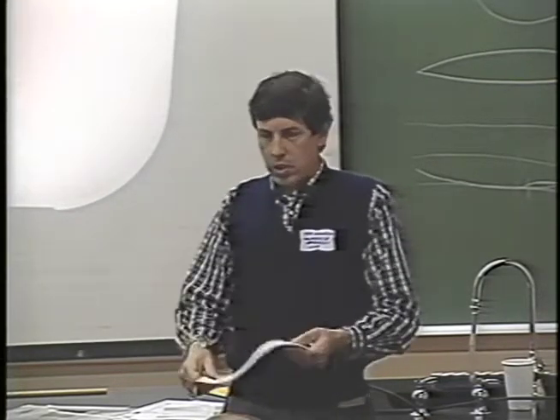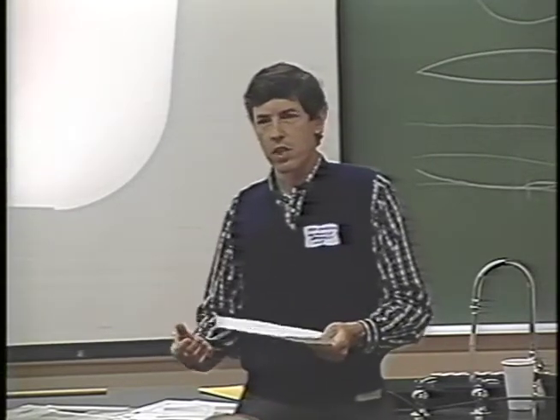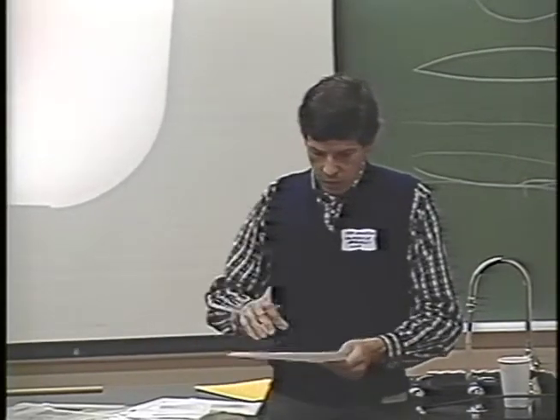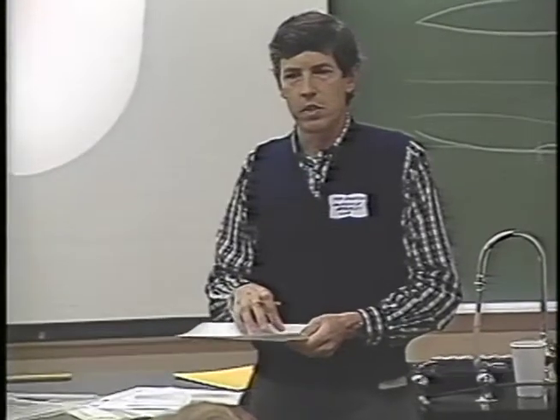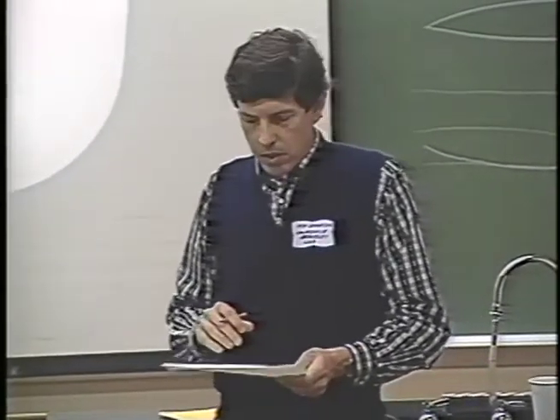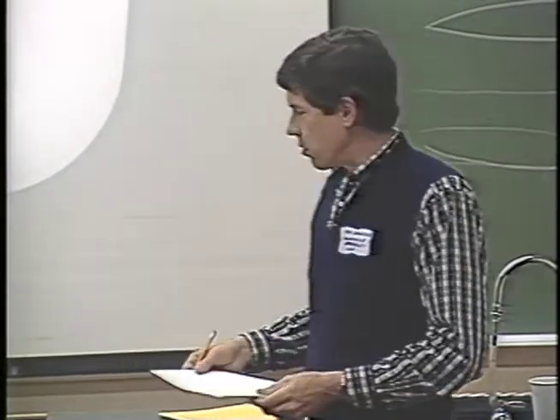Now, this motion, if the specimen is illuminated over wide angles, actually causes a tremendous loss in contrast at high resolution, or a loss in resolution. With spot scan imaging illuminating just a small spot at a given time, that motion is decreased tremendously, and the contrast at high resolution is much improved.